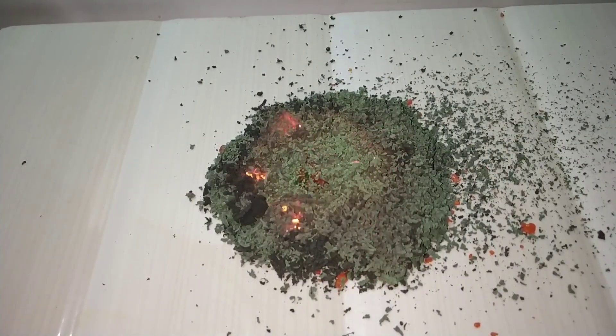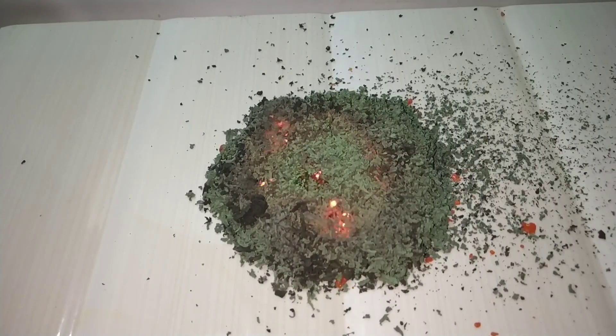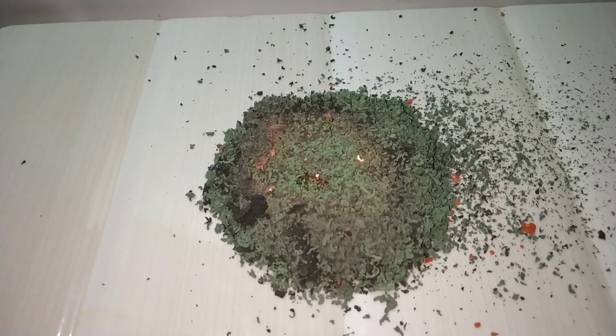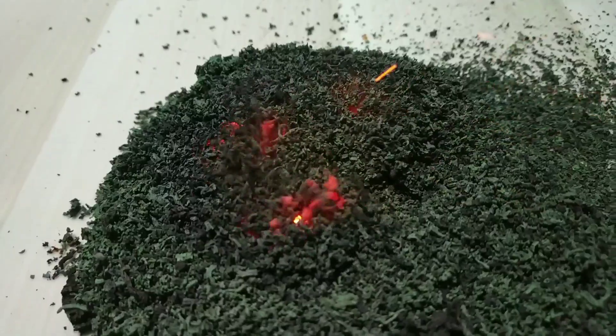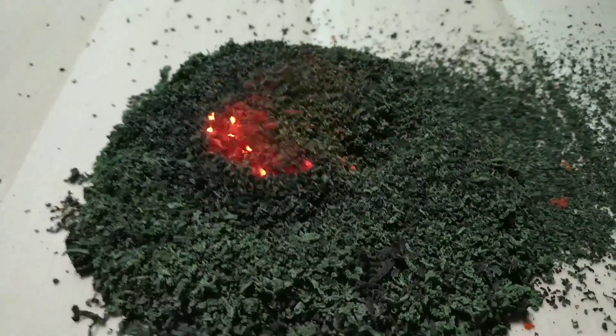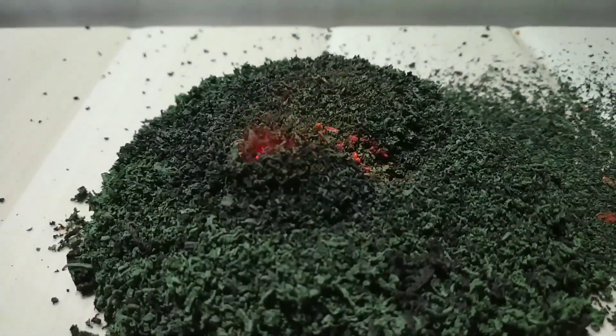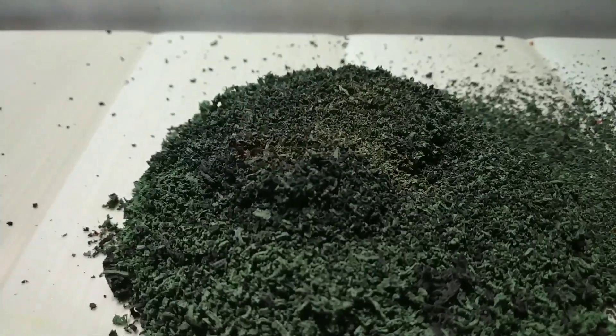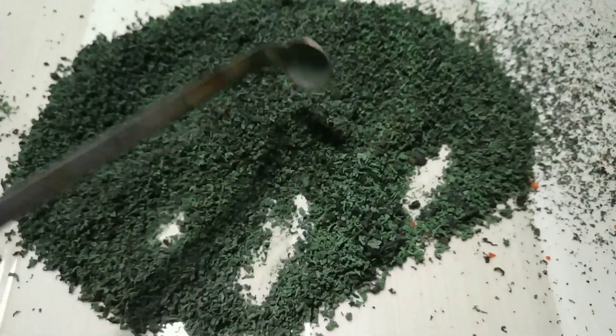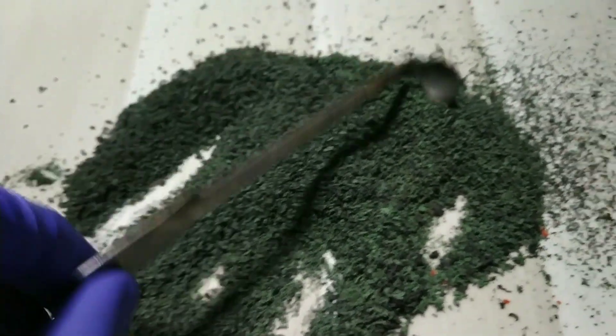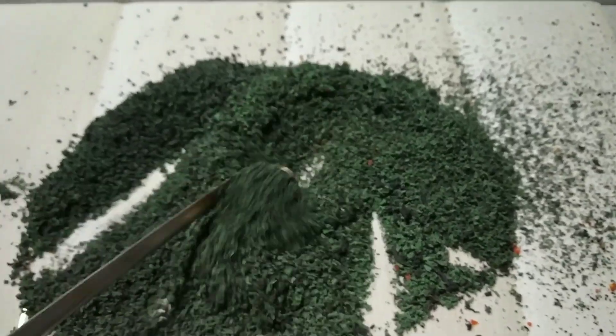In this process the hexavalent ammonium dichromate, that is chromium 6 plus, is actually getting reduced to chromium 3 plus. After the reaction is complete we are left with this green fluffy thing that is the chromium 3 oxide.